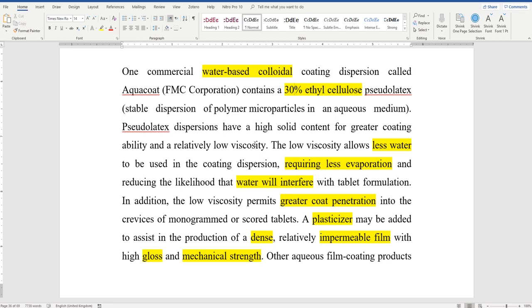One, the liquid can get into crevices or into grooves. يعني إذا في for example monogram in the tablet، في هناك marks في التابلت that I've put them, they can get inside and you can see these crevices because they don't build a bridge. ما بيسووا bridge. They don't make a bridge and cover the crevices. No, they can go inside.